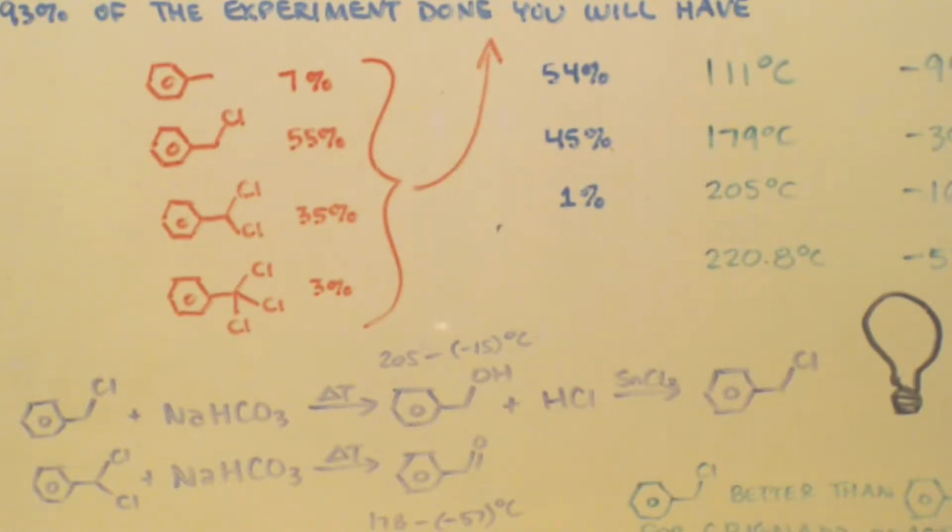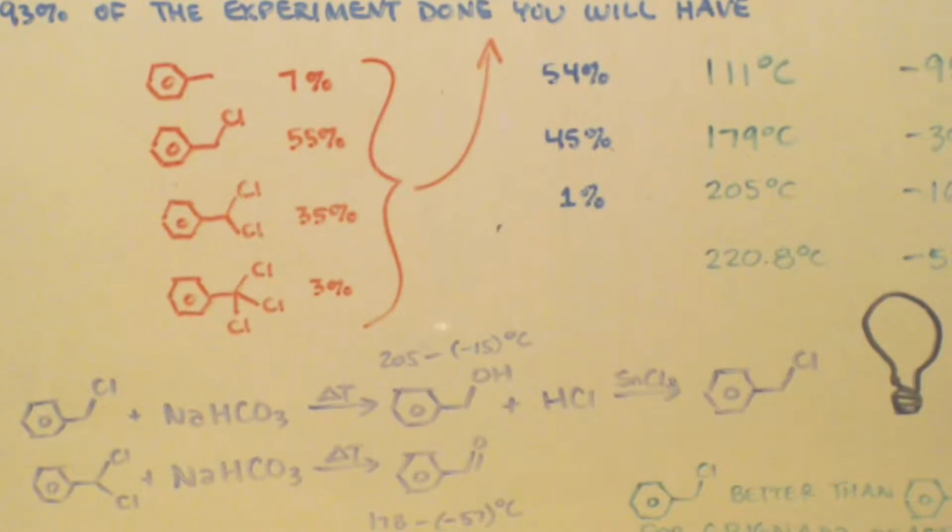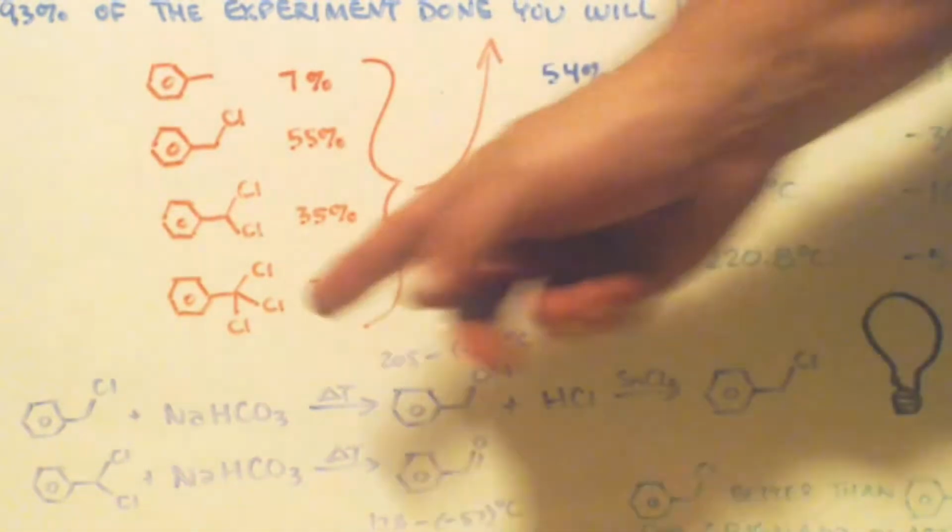Your UV source isn't strong enough to turn it all into free radicals as it's coming out the tube. Or else you're not directing the light right where it comes out of the tube. So keep that in mind. If you smell any chlorine, the reaction is either over or you're doing something wrong. So you just pump in your chlorine for this, and wham, bam, there you go. You don't have to worry about these, because if you put enough chlorine in there, you're going to turn it all into benzyl trichloride.